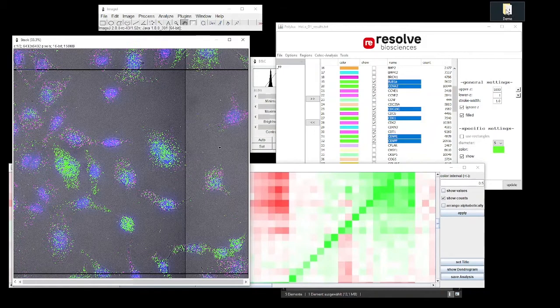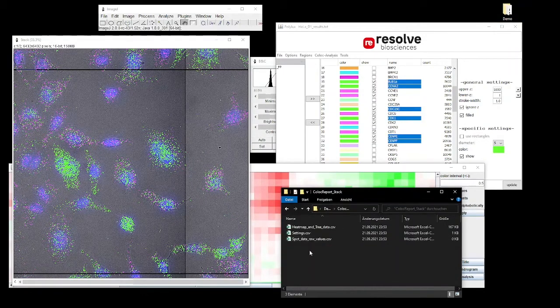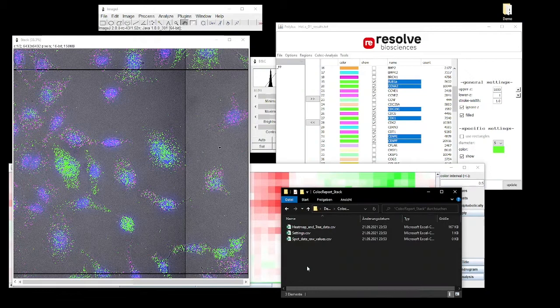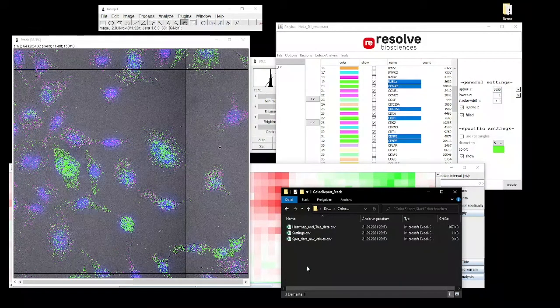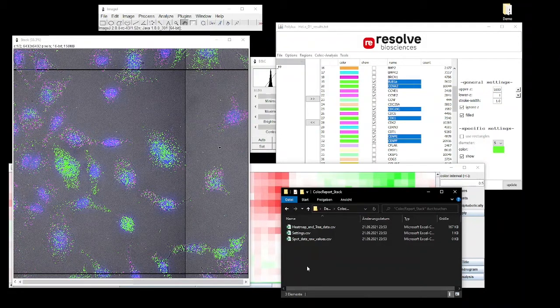It's clearly seen that the green transcripts actually co-localize with each other, and the purple transcripts also co-localize with each other, but they seem to avoid.